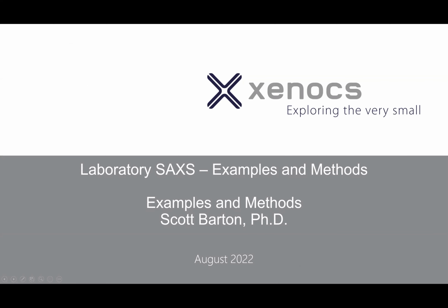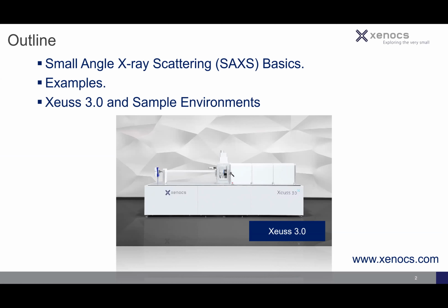Okay, great. This is a modern X-ray system for small angle X-ray scattering that does SAXS to WAXS on one platform. It's very similar to what you have now, just a newer version with more automation and newer components, kept up to date with the current times. There was a big change in what we can do within the past 10 years. The most substantial change has been in detector technology, and you have one of those types of detectors now. We'll talk about that later.